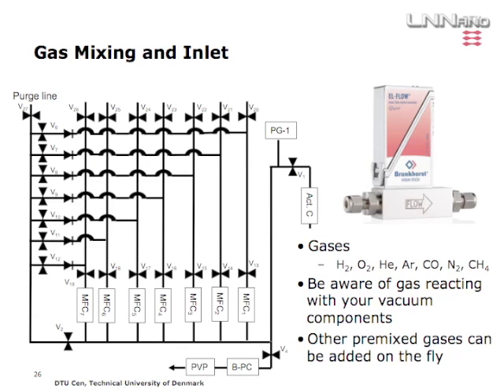This is how our gas inlet system looks. 9 out of 10 experiments are done in hydrogen, so we want hydrogen, and most of the rest of them are done in oxygen. Then we also have a couple of inerts and other gases that we can imagine people using on our system. We have our high pressure lines coming in from the top here. We have the 7 flow controllers with these 7 gases mounted.